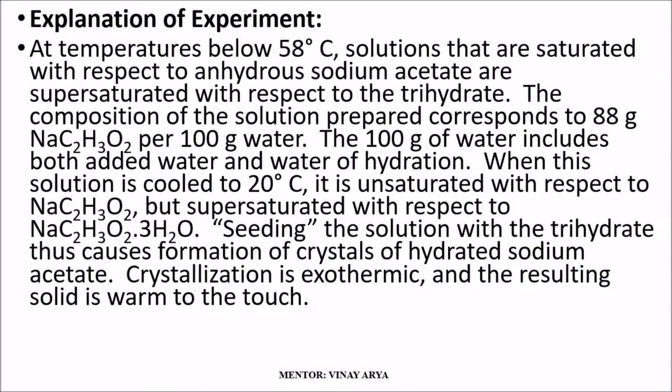When this solution is cooled to 20 degrees Celsius, it is unsaturated with respect to NaC2H3O2 but supersaturated with respect to NaC2H3O2·3H2O, that is, 3 waters of crystallization. Seeding the solution with the trihydrate thus causes formation of crystals of hydrated sodium acetate. Crystallization is exothermic and the resulting solid is warm to the touch.